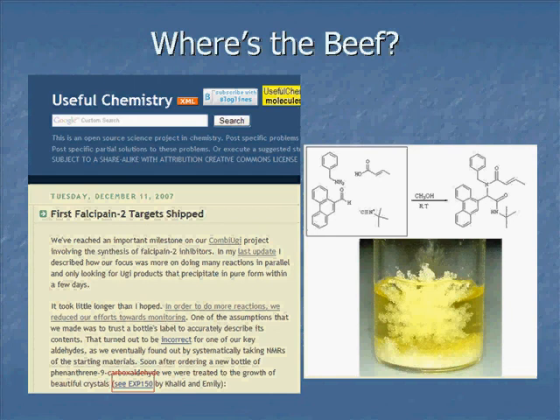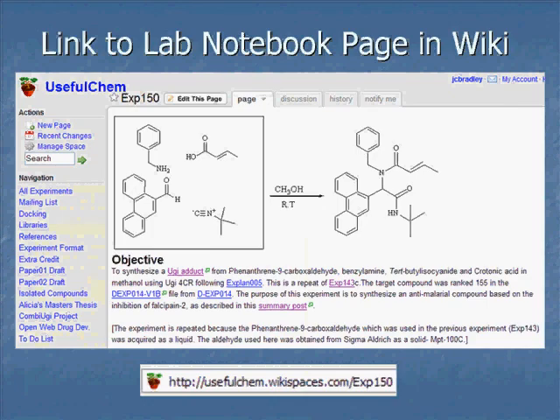Here's the blog post where I talk about making some falcipain-2 targets. At the bottom in red you see it says 'see experiment 150.' When you click on that link, it takes you to our lab wiki. The wiki is basically just a collection of pages. Each page is very similar to a paper notebook except that I can have links, embed images, embed videos, and do all kinds of things.